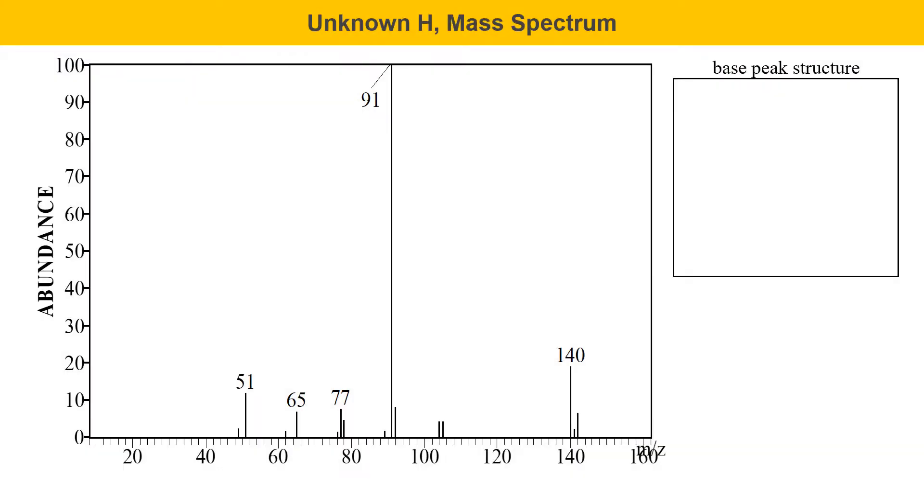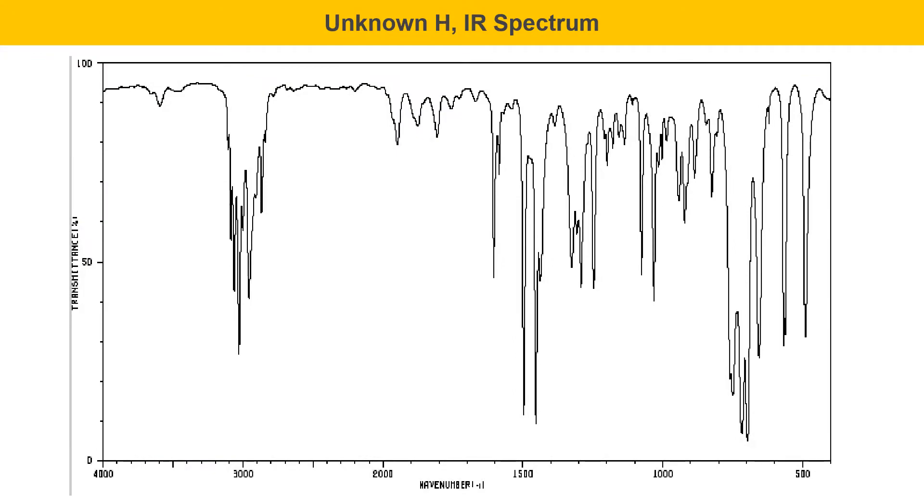Here's the mass spectrum of unknown H. One of the things you should be aware of is that the molecular ion region here has two peaks. One peak at 140 and then a significant M plus 2 peak at 142. You should figure out what that means. Here's the IR spectrum of unknown H.